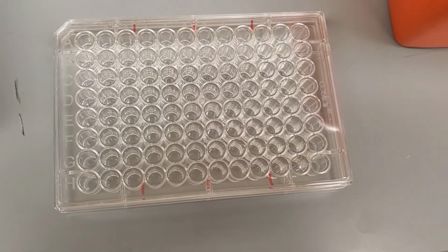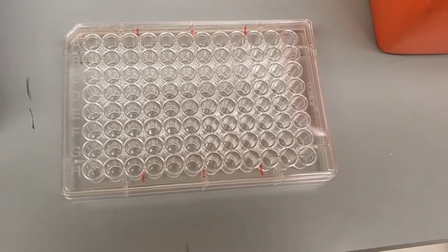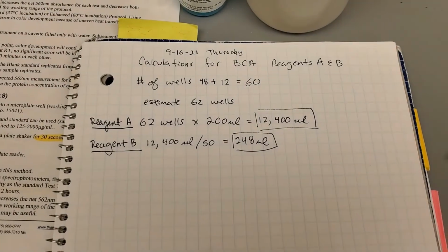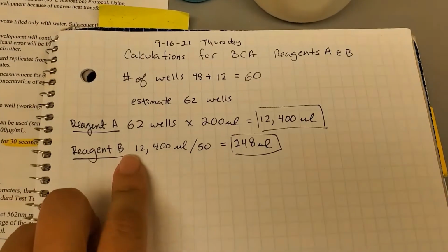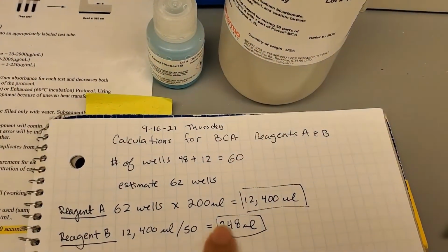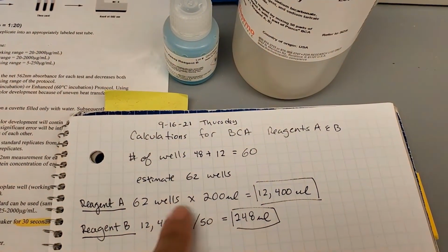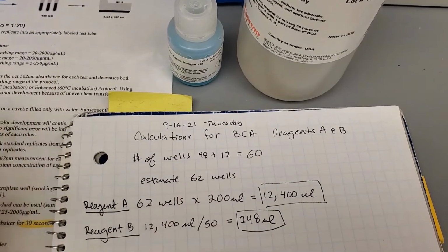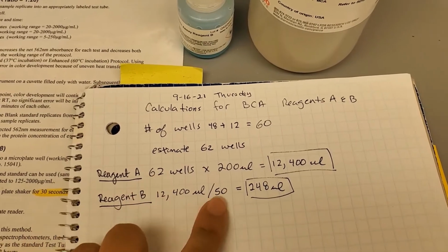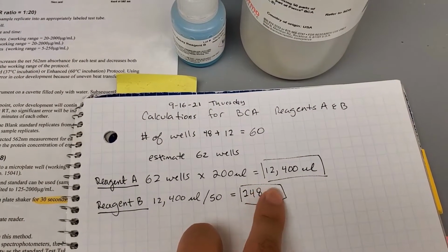Once I loaded all my samples and protein ladder, then I make the calculations to know how much of the reagents A and B I need for my assay. Here I'm showing the calculations I did for my BCA reagents A and B. So the number of wells that I'm using is 60, and I always estimate up. In this case, I added 2 more extra wells to make sure that I don't run out of reagents. So for my reagent A, I do 62 wells times 200 microliters, and so I know that I will use a total of 12 mils and 400 microliters.